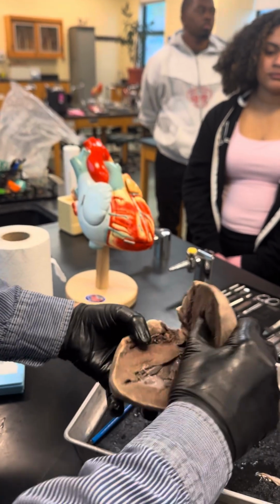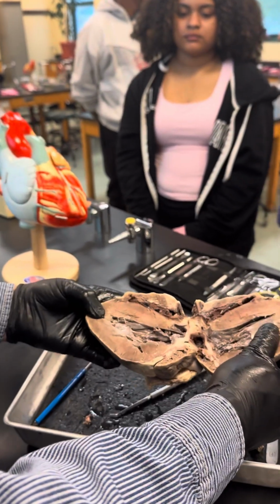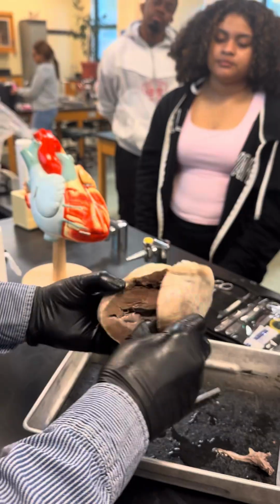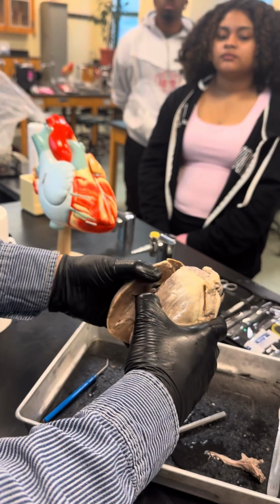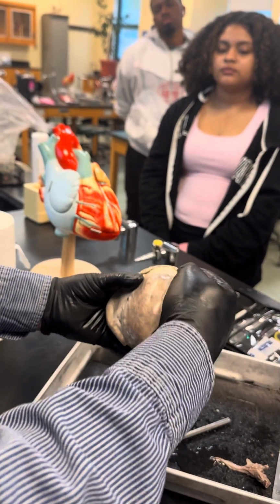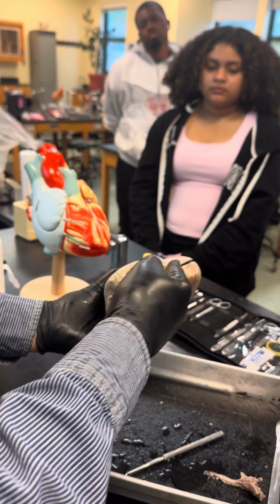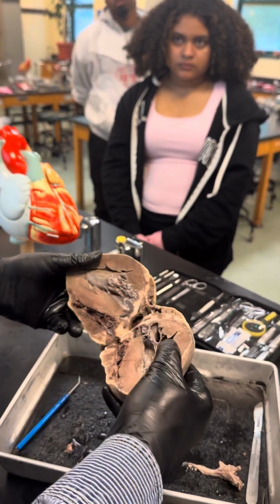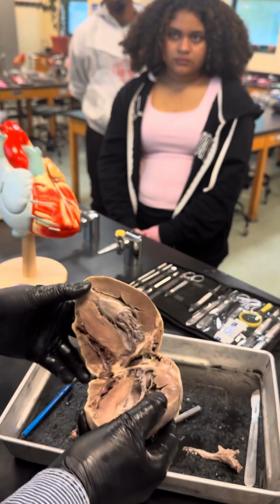Okay. So, do you have any questions here? You just dissect the heart from the lateral side, and you observe everything inside the heart. And if you have any questions, you can talk to me. Thank you.